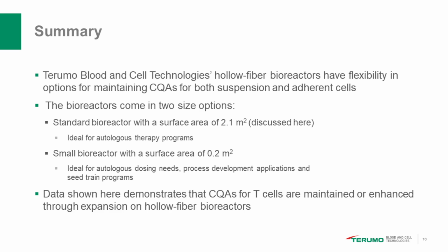Okay, great. And as a reminder to our audience, you can go ahead and type in your questions for our speaker now. Our first question is: what is the difference in this solution compared to a Xuri or a stir tank with ATF?